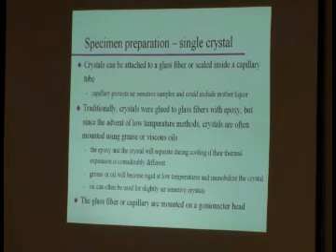So, what do you do once you've found your perfect single crystal? Well, most of the time, you actually attach them to a glass fiber or you seal them inside a capillary. Capillaries are mainly used if you need a special environment or your sample is air sensitive. The traditional way is the glass fibers.